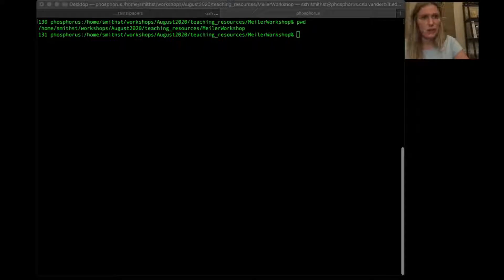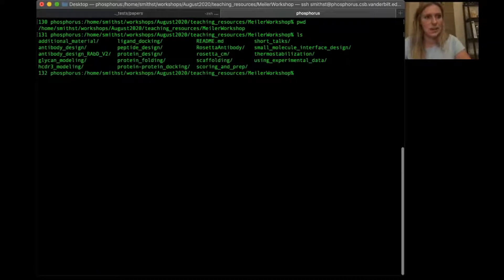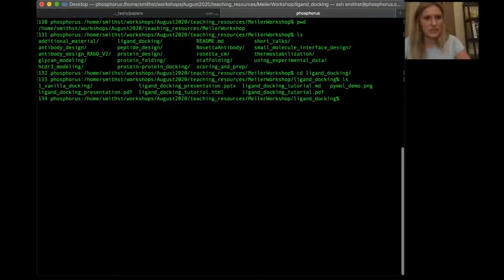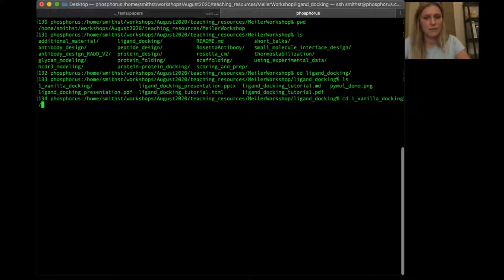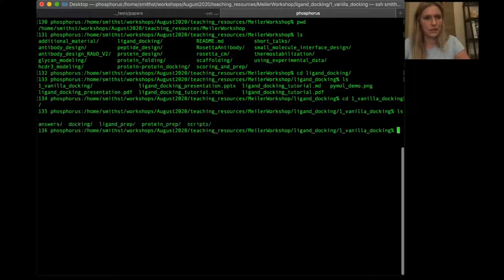Let's get going. I ran PWD and I'm currently in my version of the Meiler Lab workshop directory. I'll ls, and we can see 'ligand_docking', so we'll cd into ligand_docking. I always ls after every directory change. We're going to be in 'one_underscore_vanilla_docking' — vanilla meaning just the standard protein-ligand docking protocol.